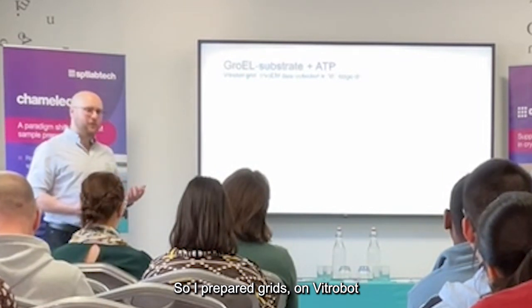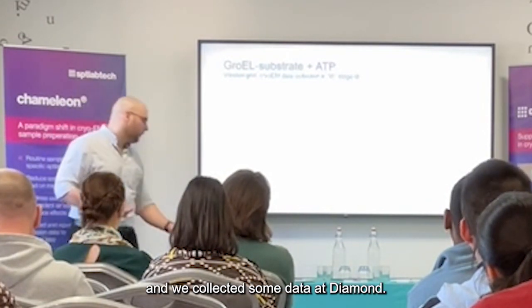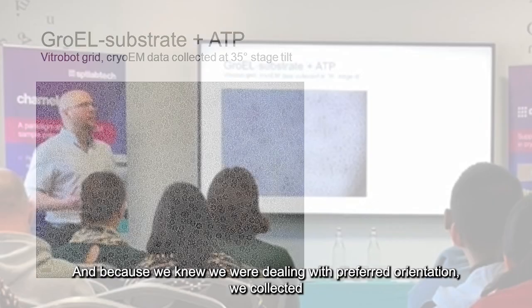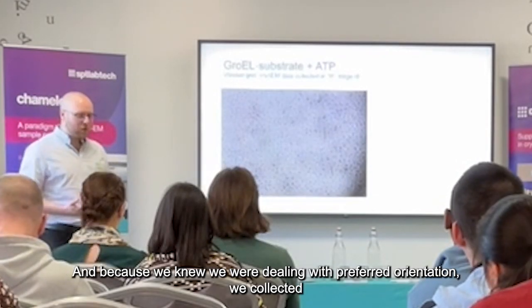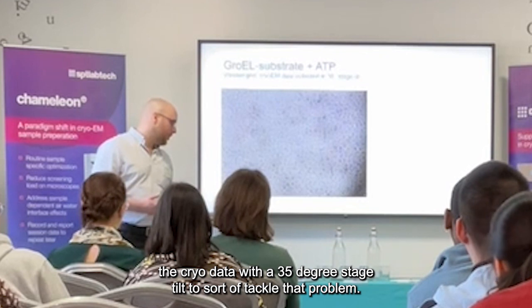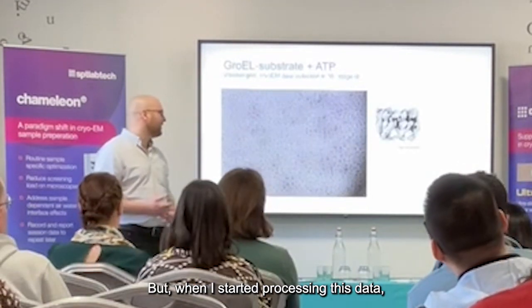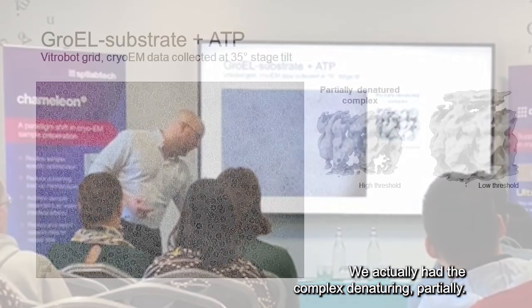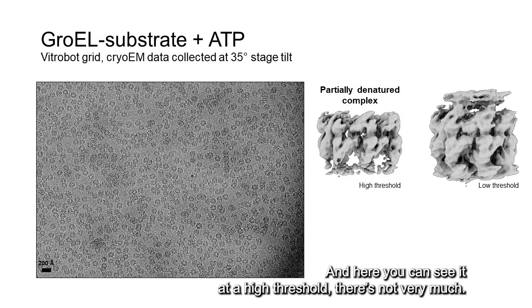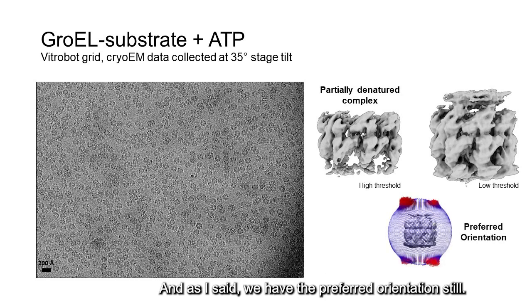So I prepared grids on a Vitrobot and collected some data at Diamond. This is just a representative image from that dataset. And because we knew we were dealing with preferred orientation, we collected the cryo data with a 35-degree stage tilt to tackle that problem. But when I started processing this data, it wasn't just preferred orientation — we actually had the complex denaturing partially. You can see the core of the complex is fairly well resolved, but at the extremities it just falls apart.